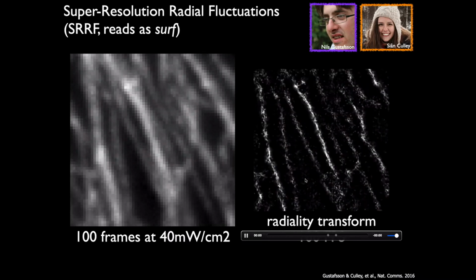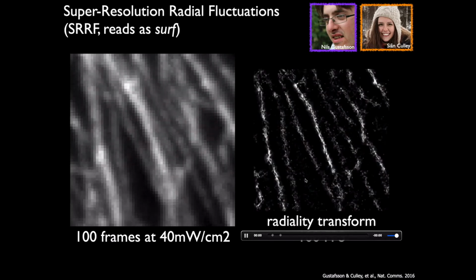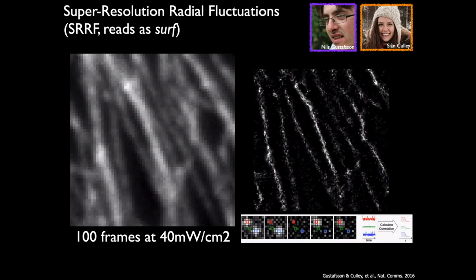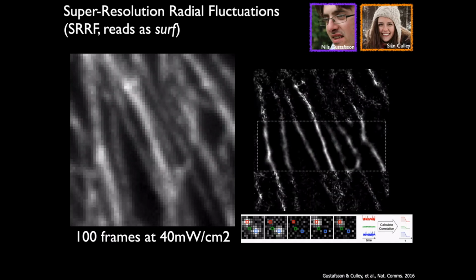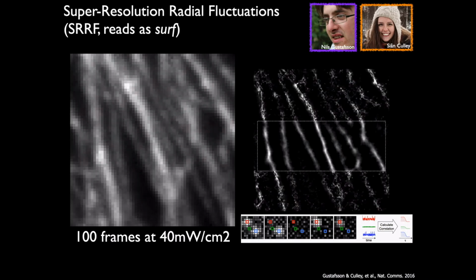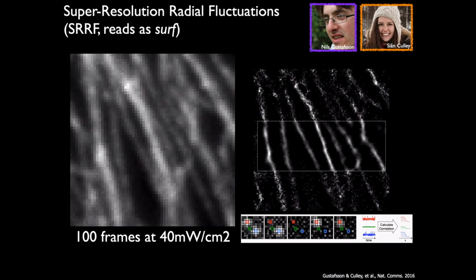Because what happens here is that noise is highly uncorrelated in time, while fluorophores have a pattern to the way that they oscillate. So if we just start projecting temporal correlations on the data that you see there, what happens is that we bring back where you actually have oscillations that are correlated, therefore the structure where fluorophores exist, and anything that is uncorrelated gets put down. All right, so those are the basic principles behind SRRF.